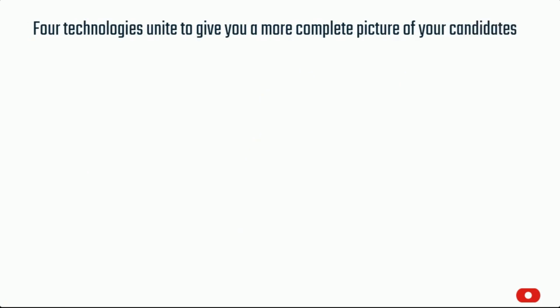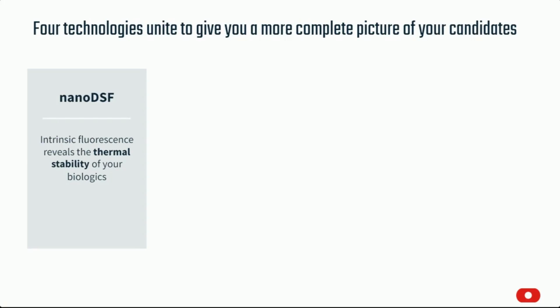Now, the Prometheus Panta gets its name from the Greek word panta, which means all-encompassing. And this instrument does truly provide you with a plethora of information regarding your sample's conformational and colloidal stability. The first technology is NanoDSF, or nano differential scanning fluorimetry. What we're doing here is monitoring intrinsic fluorescence of aromatic amino acids in response to a thermal gradient.